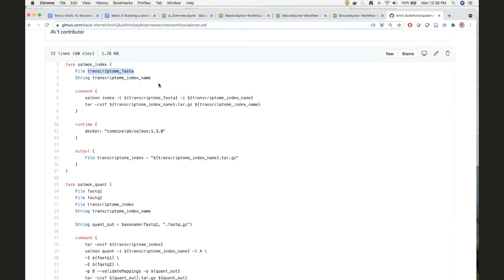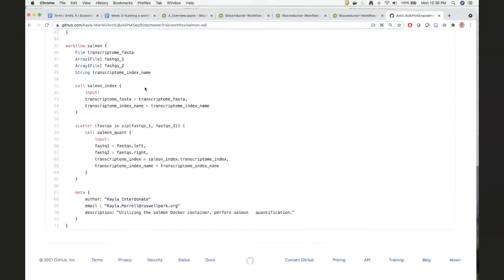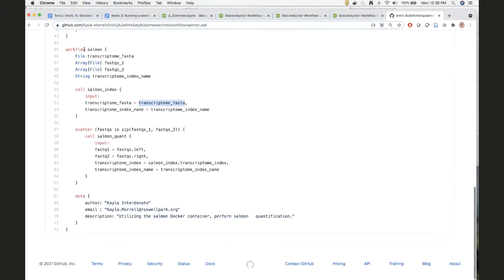Well, I think later in the workflow, when you define these, like you said, it's just going to pattern match. I don't think it necessarily depends on the order. Right. Yeah, I believe that's correct too. Okay, great. It's not totally transparent, but it says the input name transcriptome FASTA is given the value of transcriptome FASTA in this workflow. And actually, these things have been defined when we created the workflow. We'll come back and think about that.